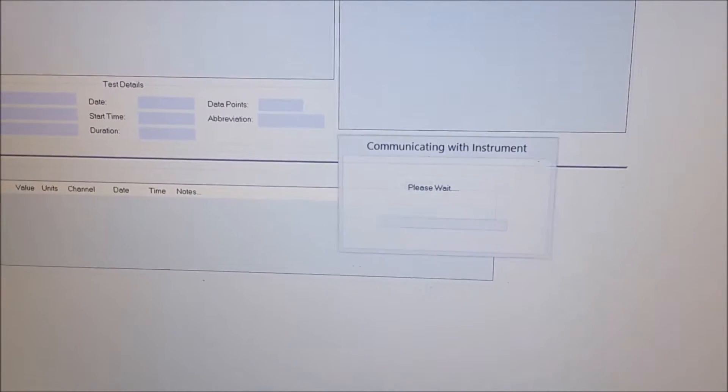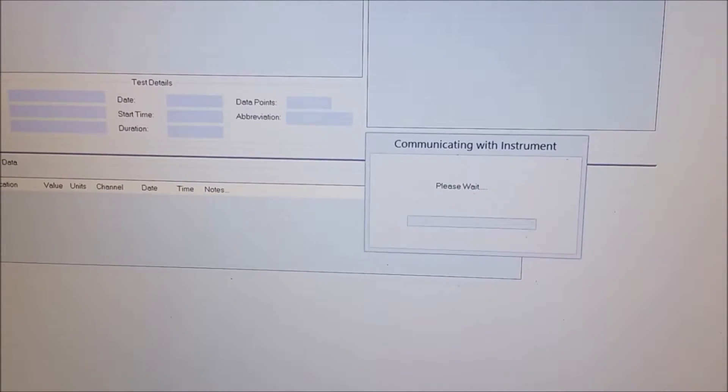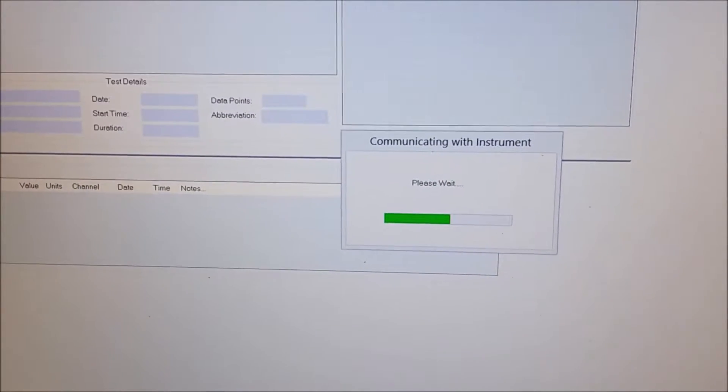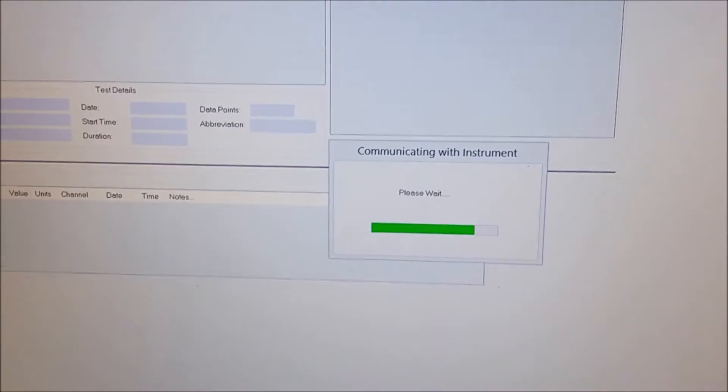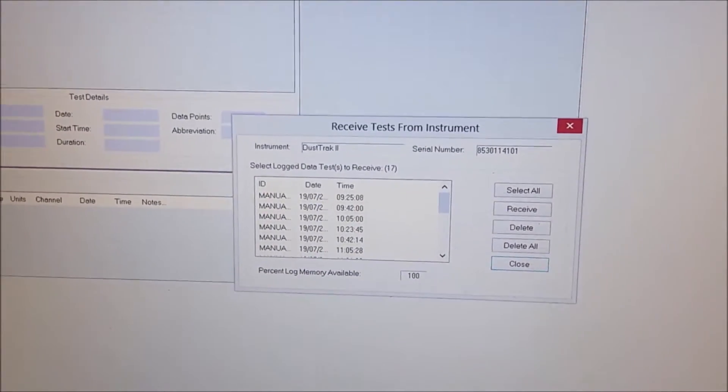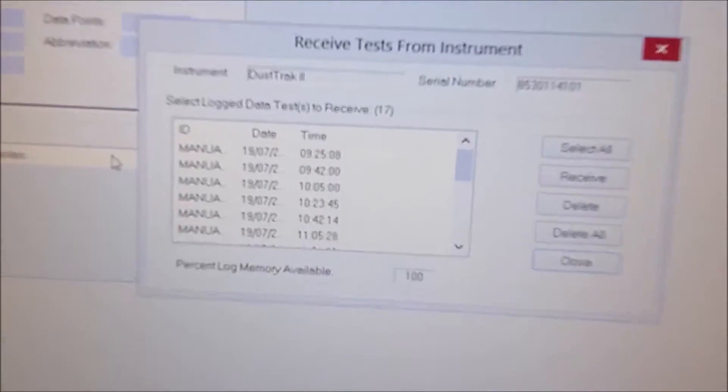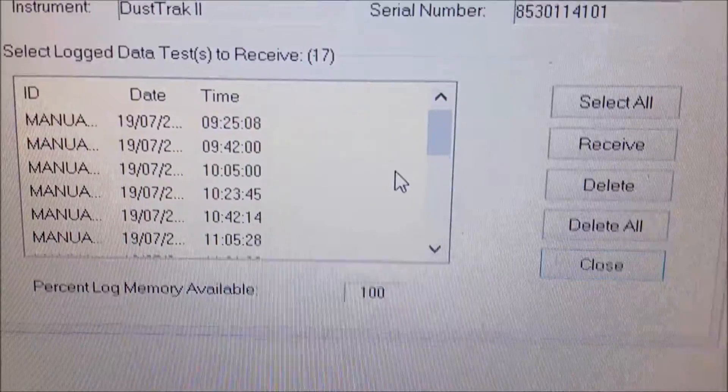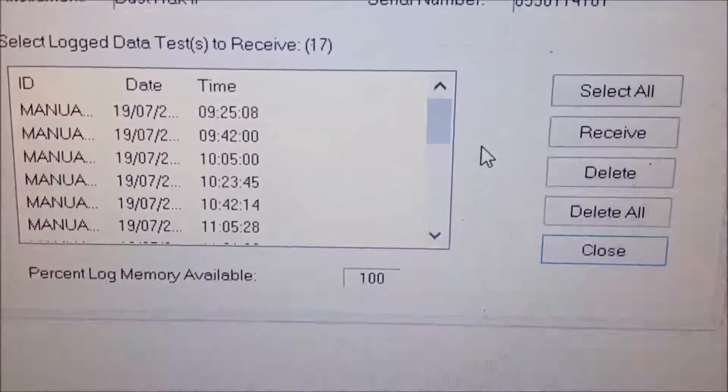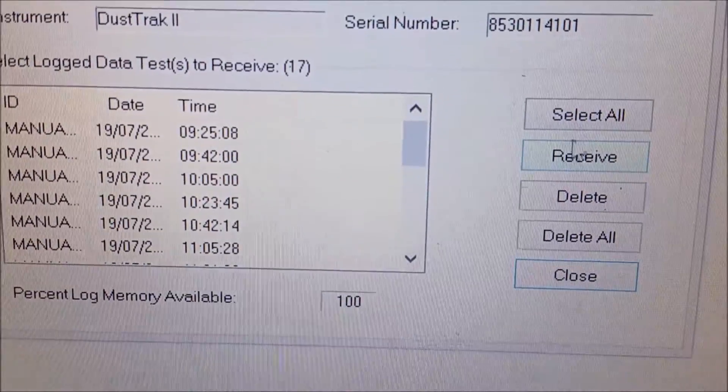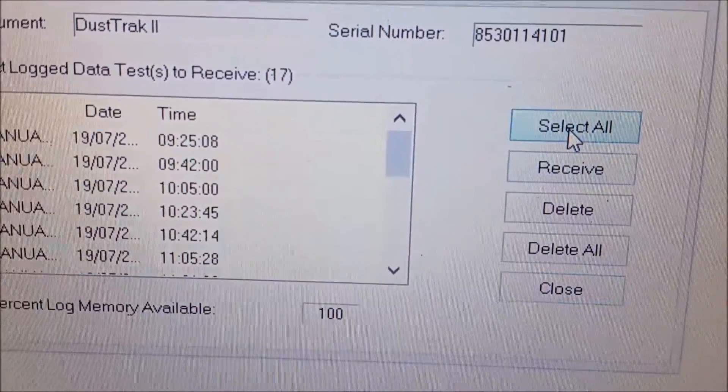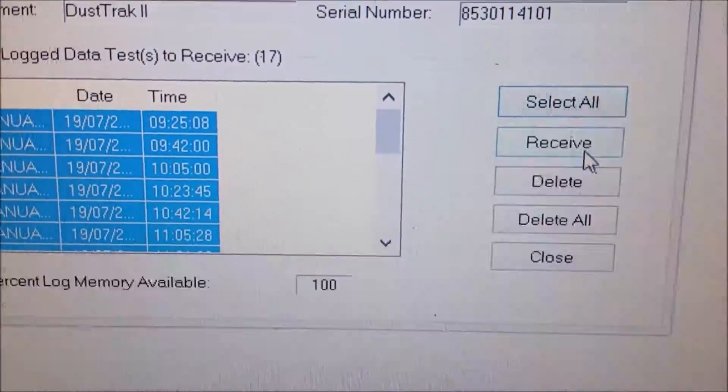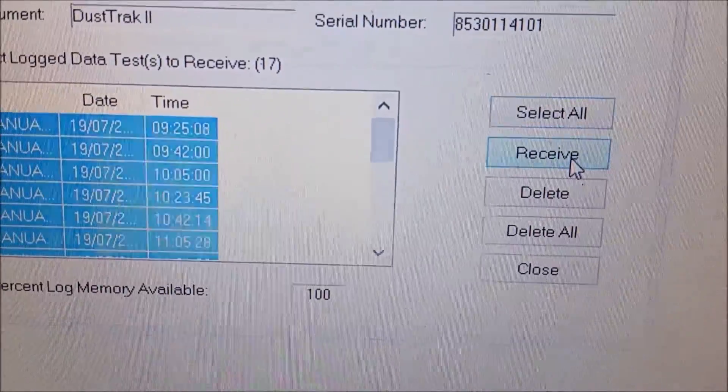So, we come over to the file and we want to receive the data. So, it's communicating with the instrument. So, it actually has the data now and we want to select all. Then we want to receive.